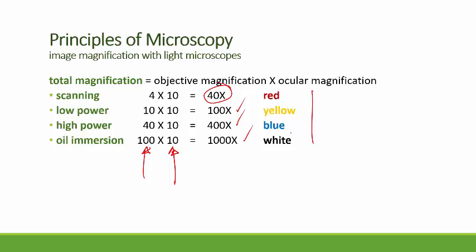Everything you ever wanted to know about how light interacts with objects and the pieces and parts of a microscope and what they do. You'll want to be ready for being able to explain what the pieces and parts do on the exam, so just be prepared for that.